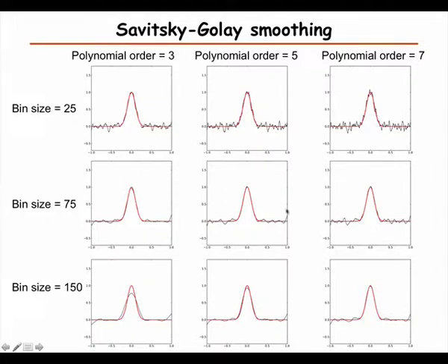But if we combine the two, we can get very nice smoothing. And this is a smoothing method that of course requires more computation, because you need to fit a polynomial to each segment, but it will give you very good smoothing overall.